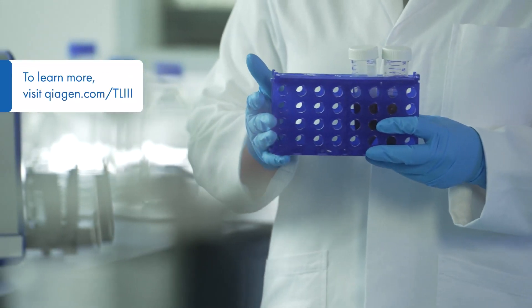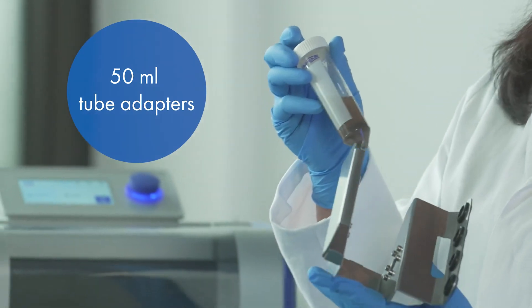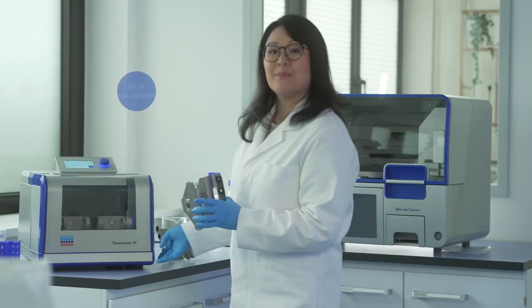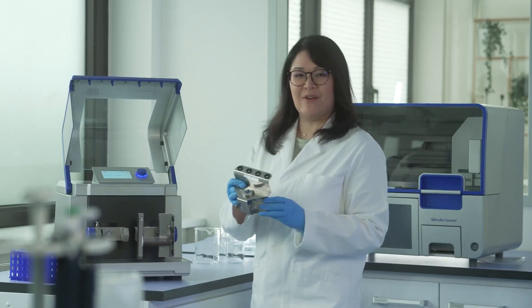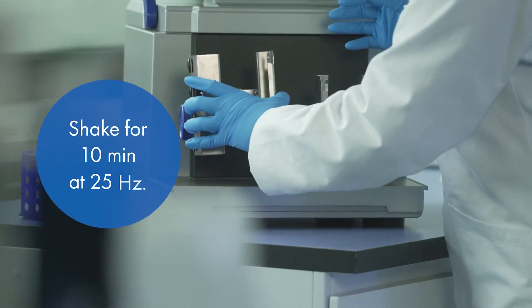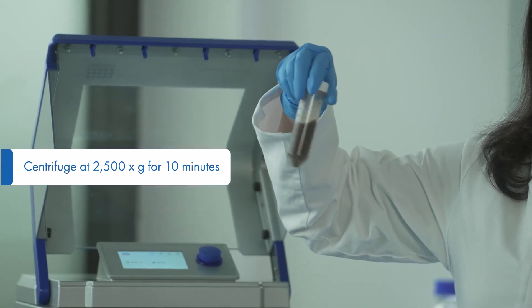Now it's time to lyse your sample. Secure the Power Max Speed ProTube onto the 50 ml adapter. Place the adapter onto the instrument and repeat the same with the left adapter. You can run your protocol. And now centrifuge your sample.